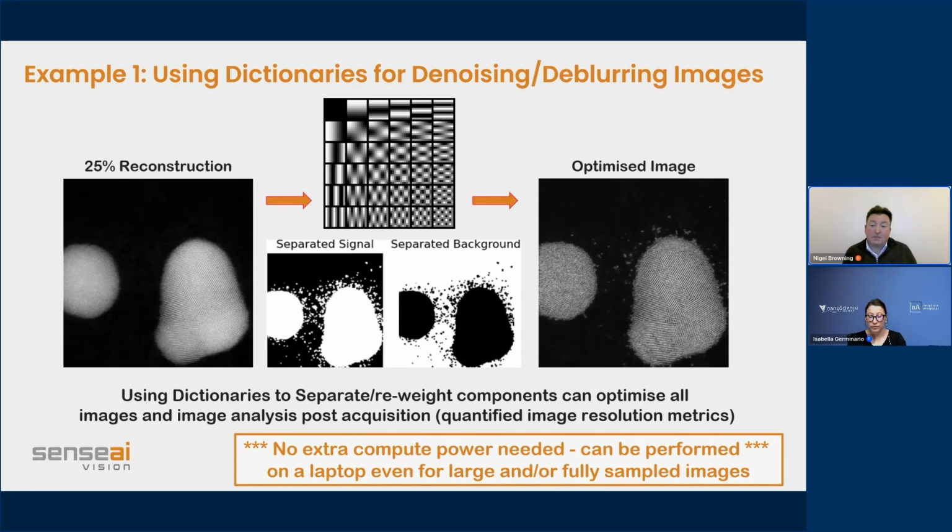So it's a way of helping with any signals where you have problems seeing things. We've looked at, for example, skyrmions before in terms of getting information on that. We've been looking at fluxons in terms of the process that you see with that. When we go and do 3D volume imaging, those aren't really giving us information on atomic structures.